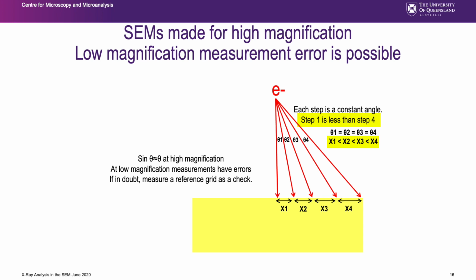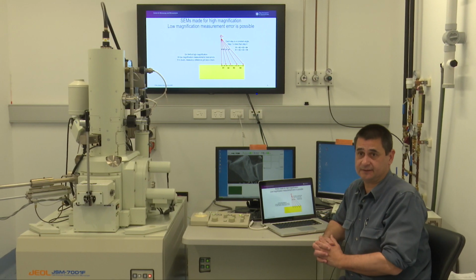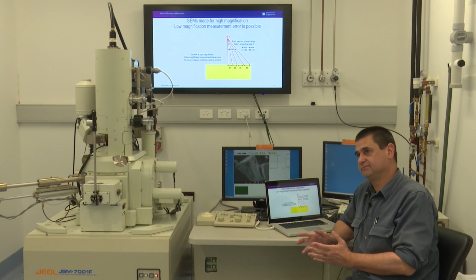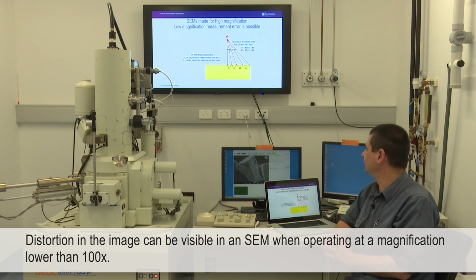Now at higher magnifications, this error fades to nothing. This is when we get to the sine theta equals theta approximation, which you would have learnt at some stage. But at low magnification, this error is quite significant. How low is low? Well, it depends on how good you want your results to be. Once I'm at a few hundred times, I'm not worried about it. Below 100 times, I'm maybe a little bit concerned. Below 50 times, I'm probably very concerned.